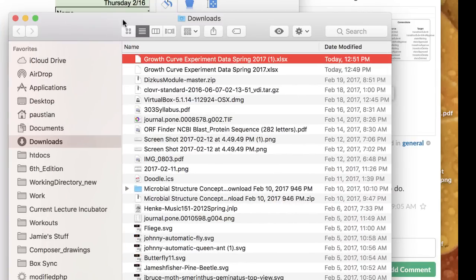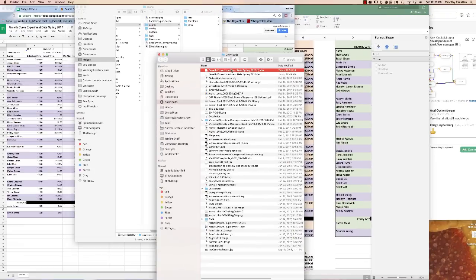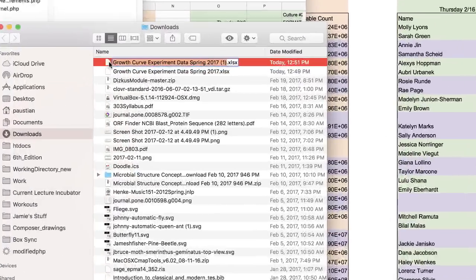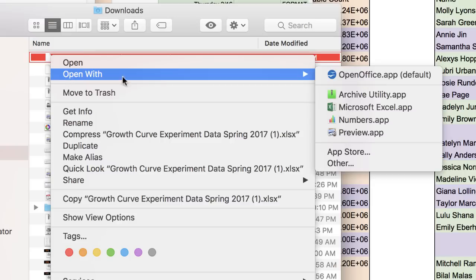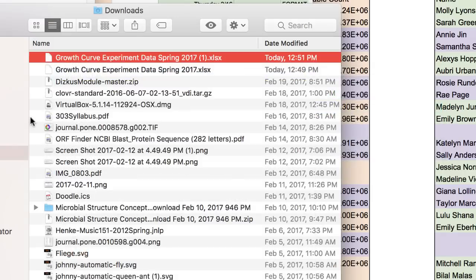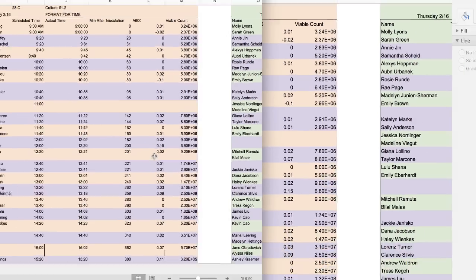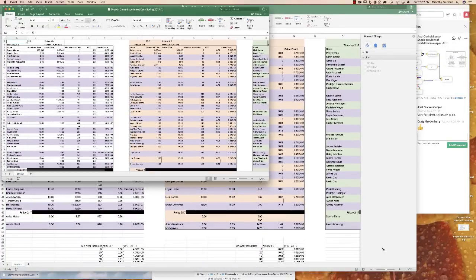It shows in Finder — it's right here. Take that file and open it with Excel. It comes up, and here's all the data.